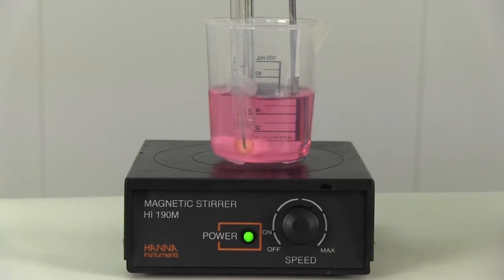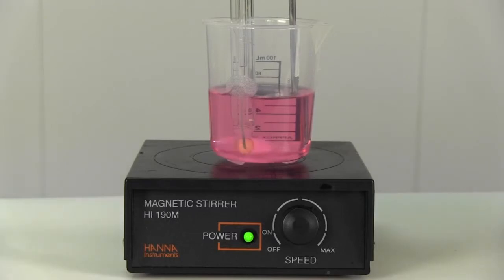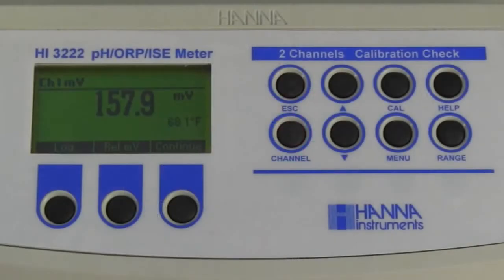In order to calculate slope, you need two values, so we need to take a second millivolt reading using a second different buffer. In this case, we will use pH 4 buffer. However, any other buffer can be used. Our second millivolt value using a pH 4 buffer is 157.9 millivolt.